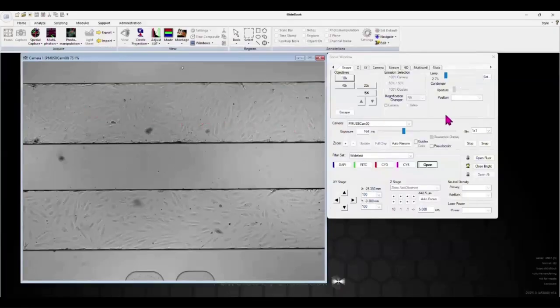As you have also probably noticed, we're starting our imaging in bright field, but we'll switch to fluorescence shortly, since we stained the Jurkat cells with Nuc Blue so you can more easily visualize where they adhere and how they flow.